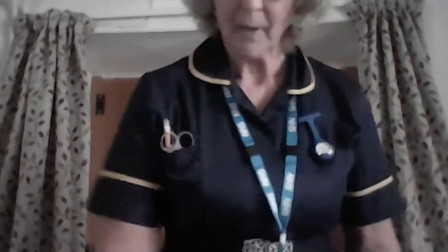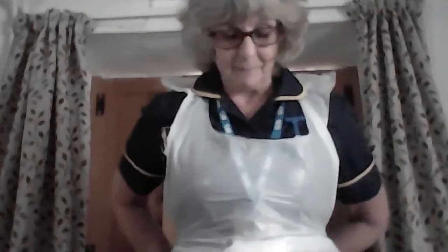So first of all, you would wash your hands or sanitize your hands. You would put on your apron. Whenever you put anything over your head, you should just briefly close your eyes to prevent any particles from going into your eyes. Do the apron up at the back and fold it down, do not flap it. And then just gel your hands as demonstrated earlier.